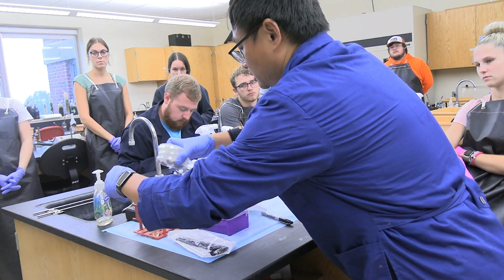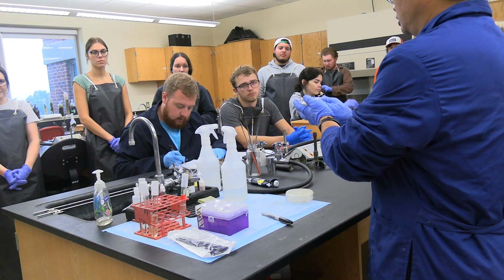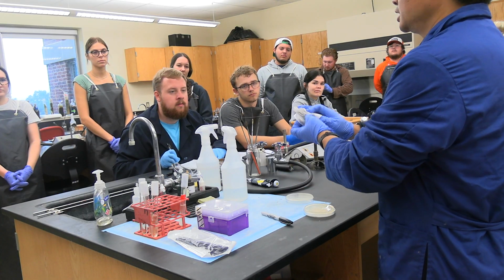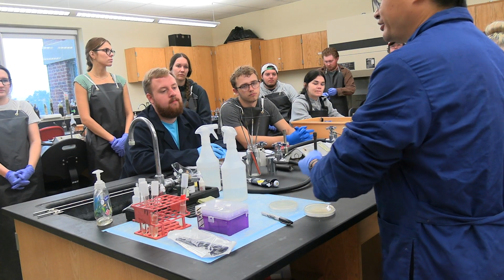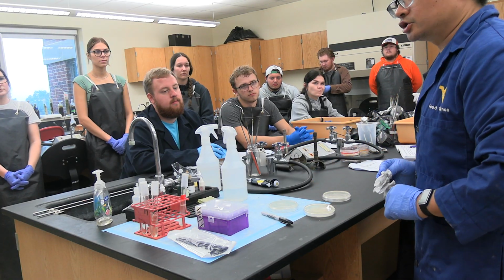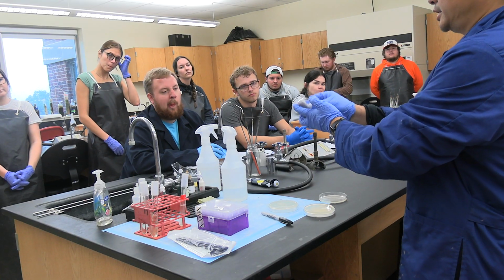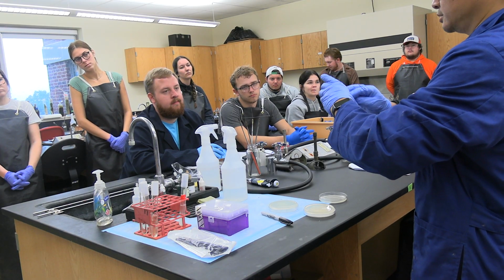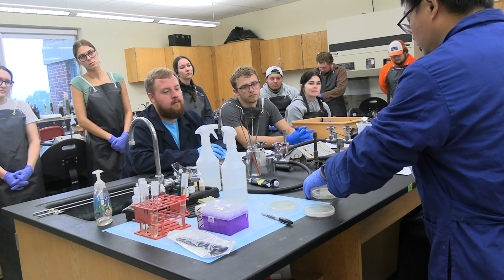First of all, these plates are just coming from the refrigerator. It's very wet. So what you should do is, the bottom needs to be dry. Otherwise, you cannot label because the Sharpie marker will be faded. Second, I don't want to cause condensation on the agar plates, which will affect the results. So the inside of the agar plates, you also should dry it. Otherwise, that liquid may cause condensation, which means your colony could be damaged.